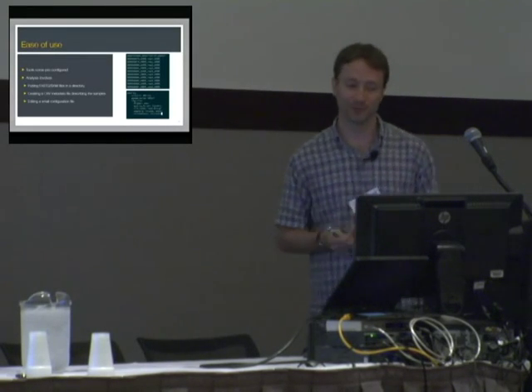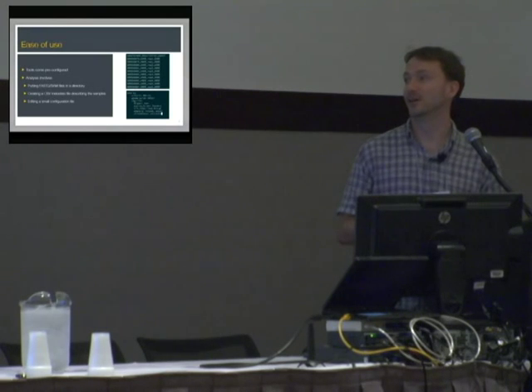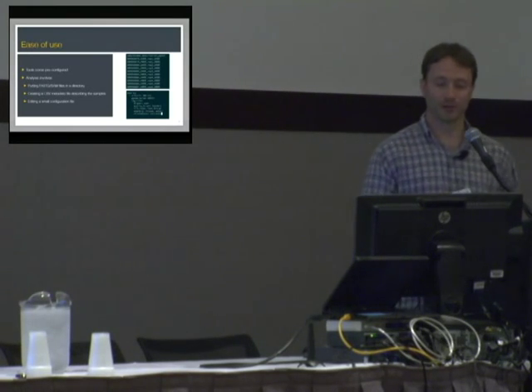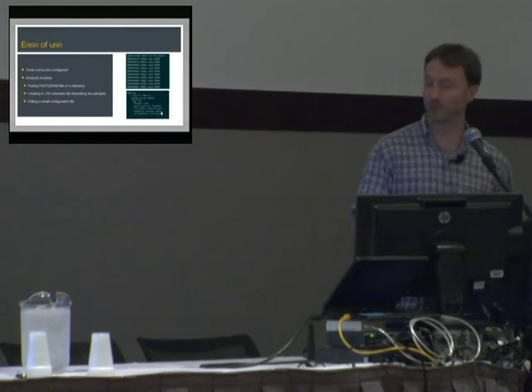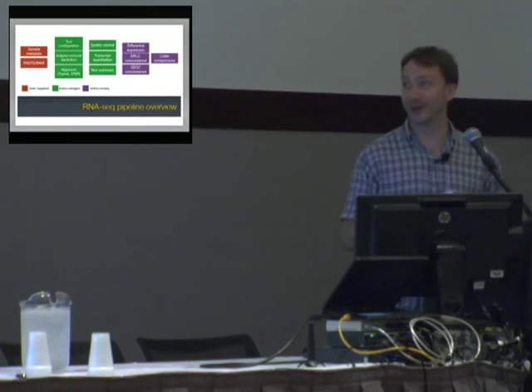So the analysis involves just sticking your FASTQ or BAM files in a directory, creating a metadata file that describes the samples, and editing a small configuration file that just says what genome you want to run and how your library was made, and we set other parameters for the tools as you go. So this is just the standard RNA-seq analysis pipeline.